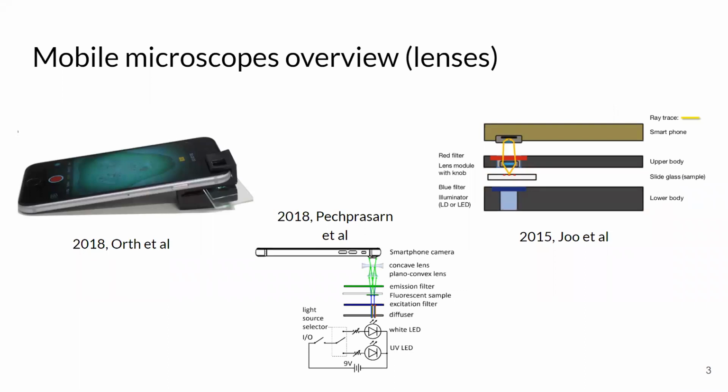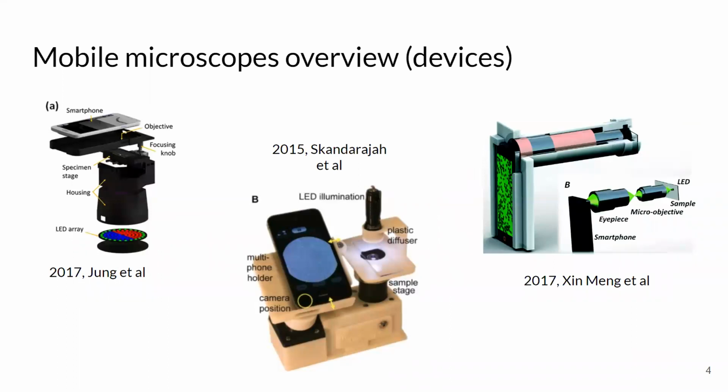In the last decade, a huge step was made in the direction of creating different constructions of mobile microscopes. A huge class in that area is formed by different lens applications, trying to provide the most universal one. That approach is the most affordable, and a lot of projects can be found both in scientific and commercial fields. Another class of mobile microscopy technology is to use more sophisticated external devices similar to original microscopes. Researchers propose different constructions and modalities. This class of microscopes is much more suitable for different disease detections, and easy to set up and tune the focal length.